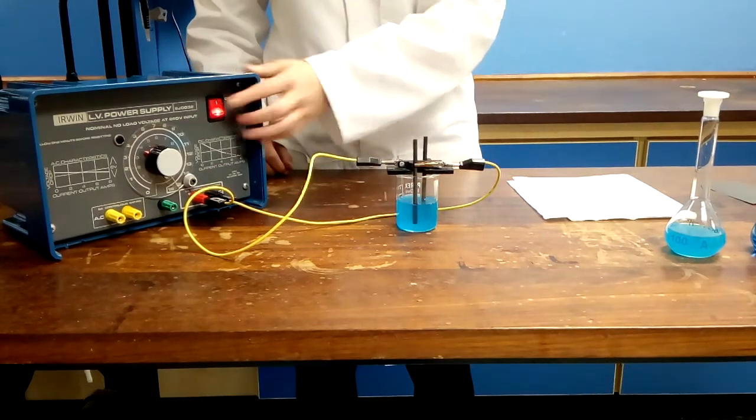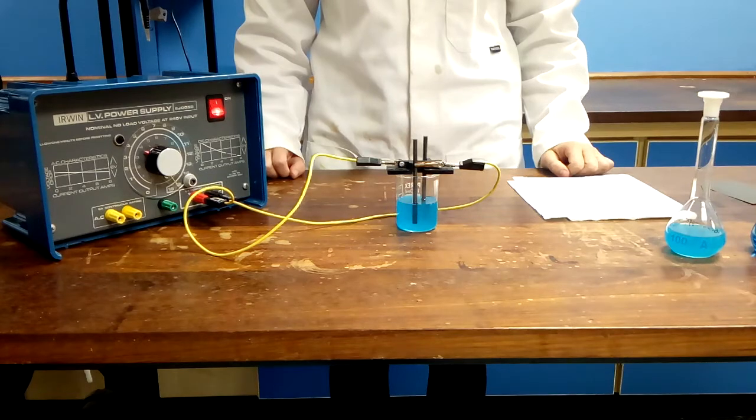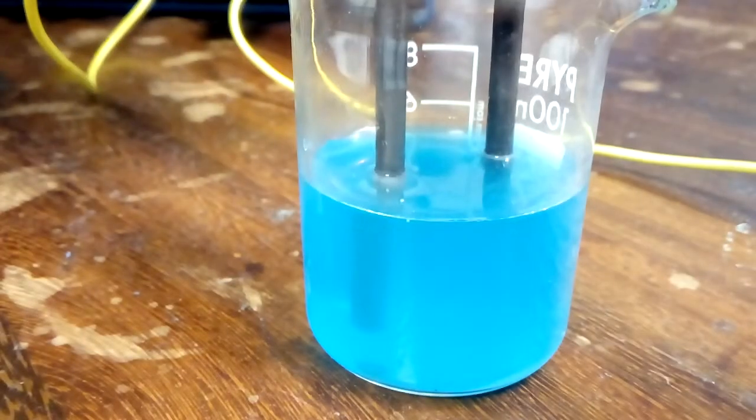Switch on the power supply and look at both electrodes in turn. First, let's focus on the anode, the positive electrode on the right-hand side of the screen. Bubbles are seen, indicating the production of a gas. To test this gas, use the blue litmus paper.